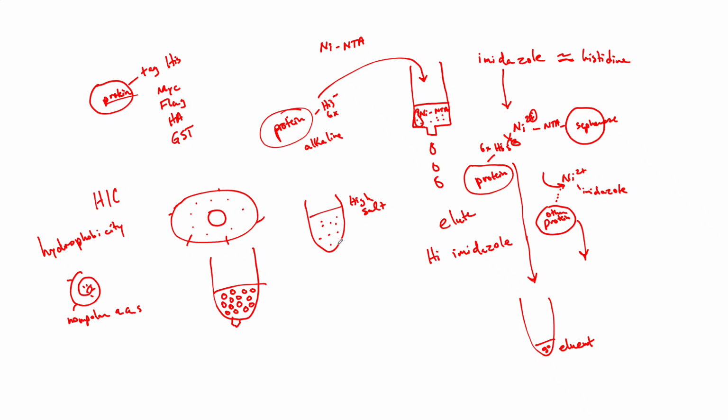In a high salt solution, because they're in with a lot of salt, there's a lot of charged ions in the water. If there are hydrophobic proteins or proteins with hydrophobic patches on their exterior, that salt makes them even more hydrophobic relatively, because the charges make them even more likely to bind to other hydrophobic surfaces, more than just water would.